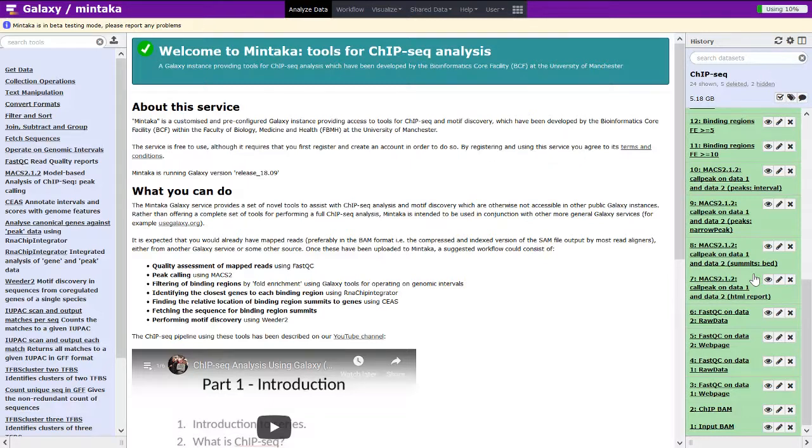So in this video, what I'm going to do is just give you some details about how you can access the instance, some requirements that you need to consider, and just a bit of an overview about what is possible.